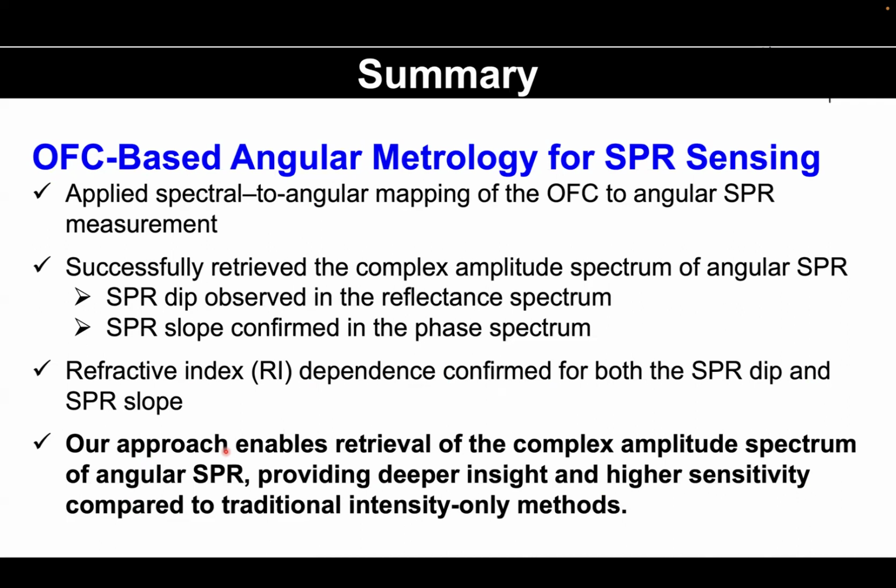And we confirm the RI dependence in both the SPR dip and the SPR slope. Importantly, our approach enables the retrieval of the complex amplitude spectrum of angular SPR, providing a deeper insight and higher sensitivity compared to the traditional intensity-only method.